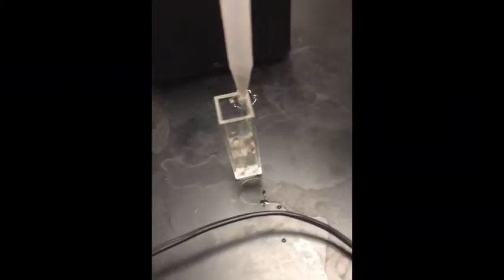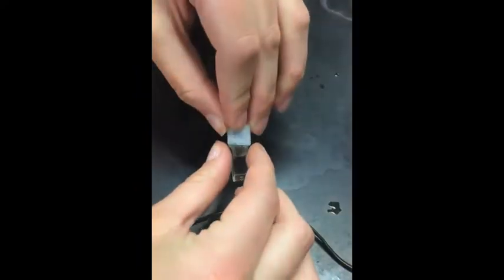When doing a colorimeter calibration, fill the cuvette with three-fourths of distilled water. Place the lid on the cuvette.